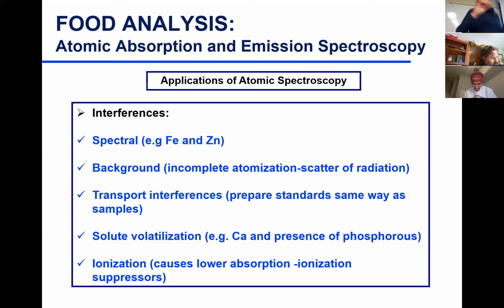If your sample is too concentrated and it's reading 20 ppm, that 20 ppm is not accurate because your calculation fell outside of your linear standard. So you want to go back, dilute your sample more, come back, measure, and make sure that it is within your standard range. Is that good, Chris? Do you want me to repeat that? Yes, thank you. Okay, good.